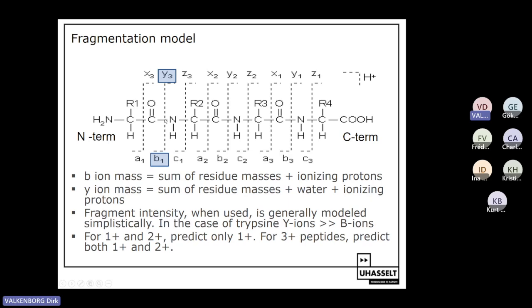And that's a good thing. If this peptide was only carrying one charge, then it would be based on coincidence if we would see the N-termini or the C-termini, so we would only see one of the fragment ions. But when there are multiple charges present, it can also be triply charged, obviously, then we will see, in most cases, the N-termini and the C-termini.